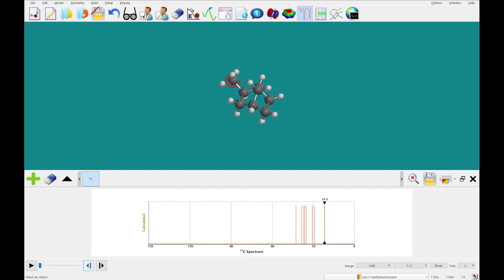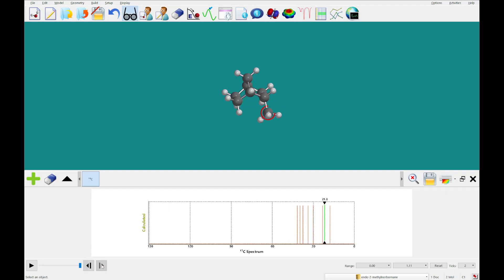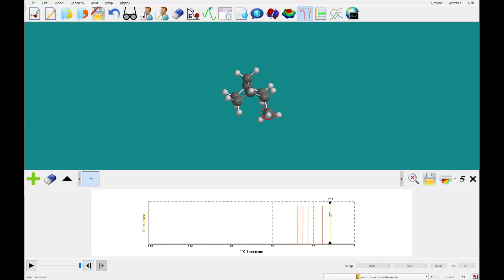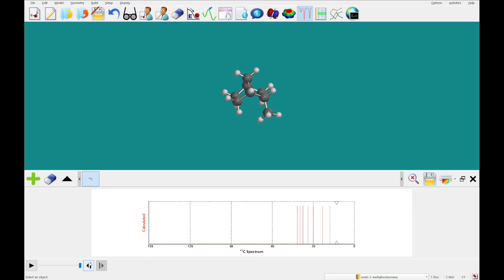So somebody would make an assignment using these shifts to be able to say, okay, all of these, let's see, one, two, three, four, seven of these are the same, but there's one shift that's different, just like there's one carbon that's different. And make the assignment that with the 17.9 shift, that must be the endo and the 21.8 shift, that must be the exo stereo isomer.